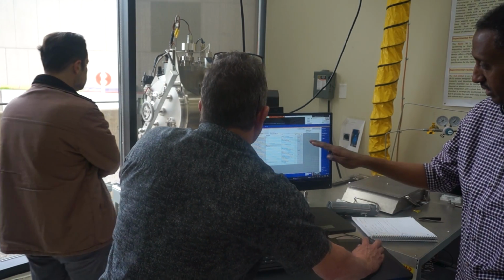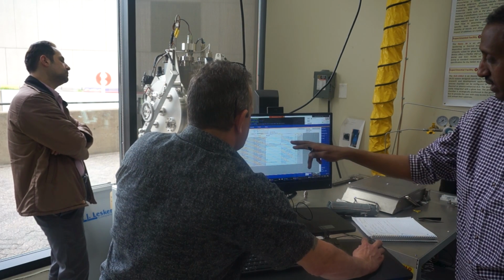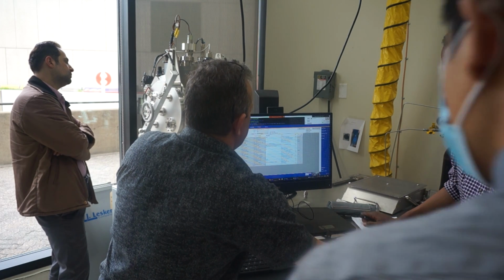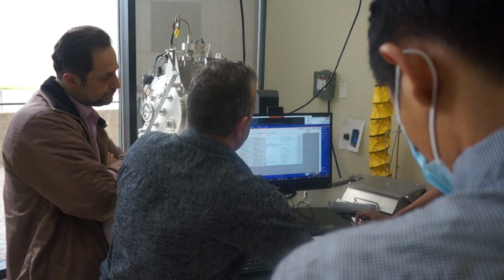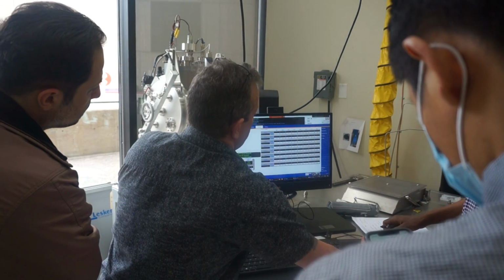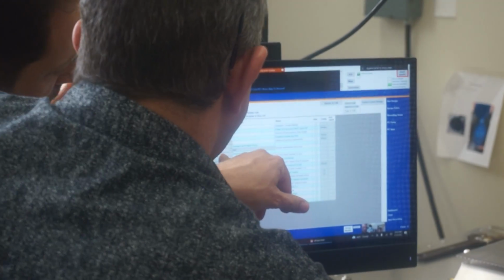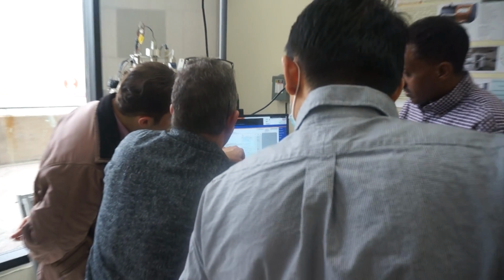There is no edit option, right? When you define a process parameter, what do you mean? When you define it, you are telling the machine TMA and H2O. You're putting the process parameters in here. So if you're running different chemistry, that's not going to be the same. The step will look the same, but instead of TMA and H2O, maybe you're doing TDMAT and H2O.